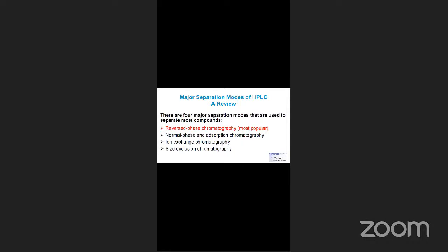Now, just to give you a brief sense about the whole HPLC system, here is an HPLC system. It's a very high-end equipment for you to really look into. If you have logged in through your phone, like the way I'm doing it, you can zoom into certain areas and see what I'm talking about. I don't have a mouse to show you, so I'll have to tell you left of the slide, right of the slide and things like that.